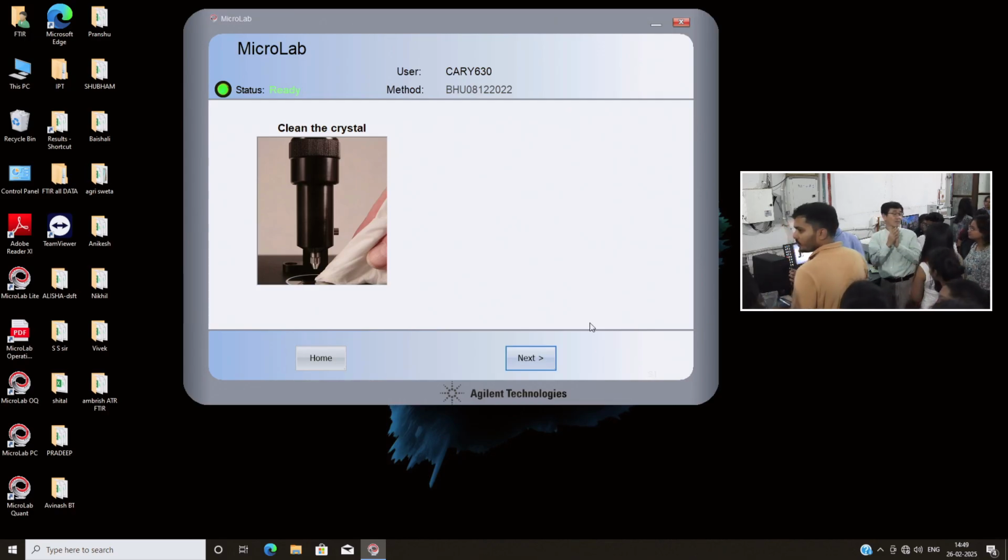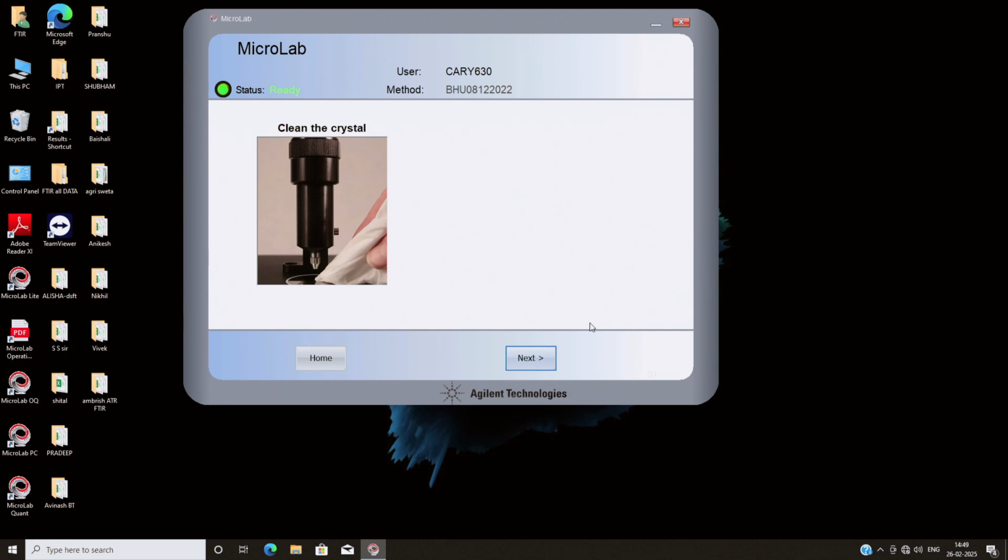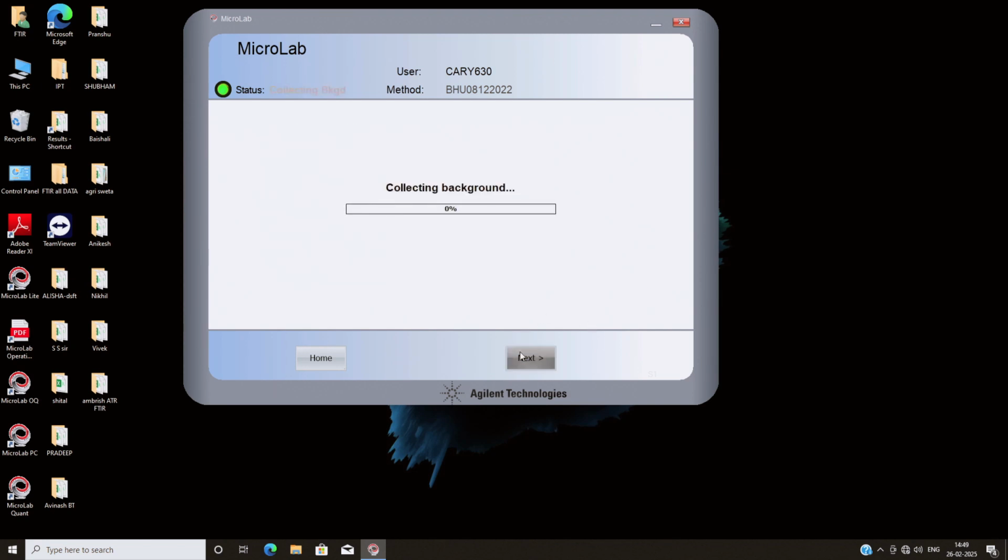We call it a spectral window. Which region is available for the spectroscopy? So if the window absorbs or shuts out light, then measurement is impossible. So we can record the spectrum only in the spectral window.